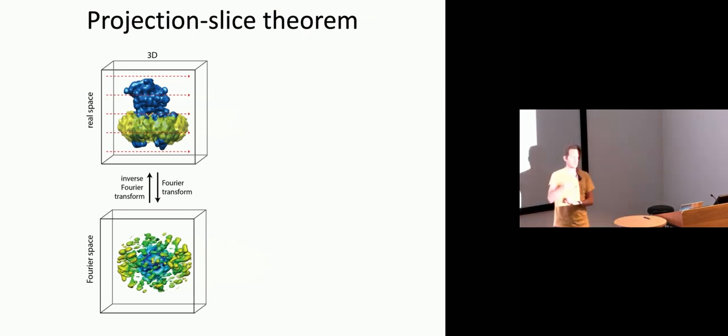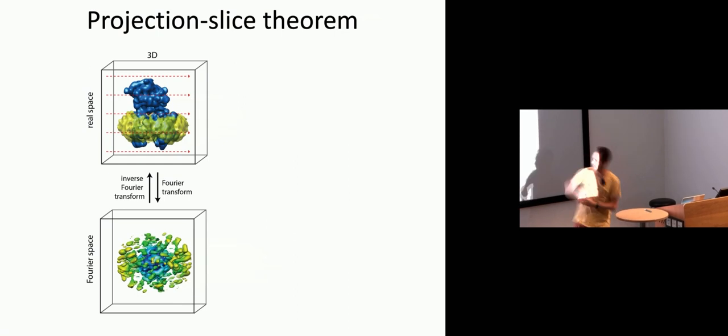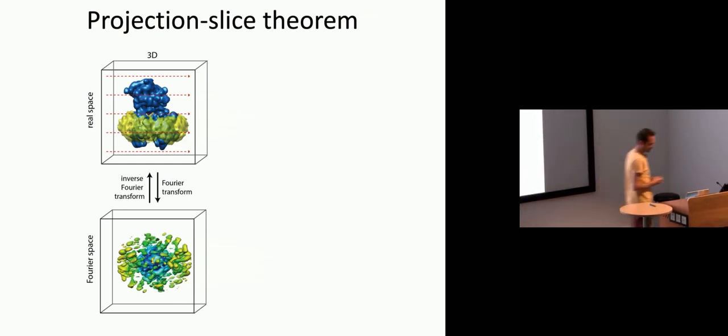If we have a three-dimensional object of a protein, for example, at the top left there is gamma secretase, we can, in the computer, calculate a 3D Fourier transform. So this is the same information expressed in a different space, and we can just use computer algorithms to go forward and backwards, swapping in between the two spaces. So I haven't done any calculations yet.